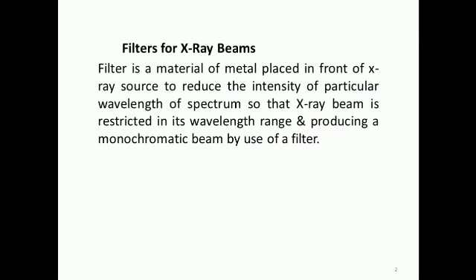Filter is a material of metal placed in front of the X-ray source to reduce the intensity of particular wavelengths of a spectrum, so that the X-ray beam is restricted to a narrow wavelength range, producing a monochromatic beam by use of a filter. Now, the figure showing the use of a filter.